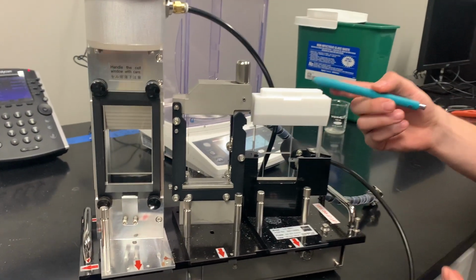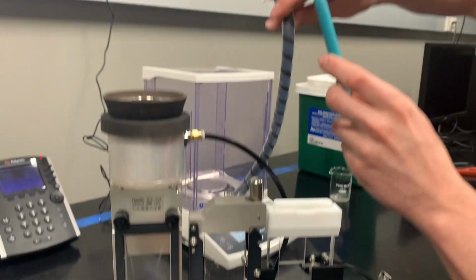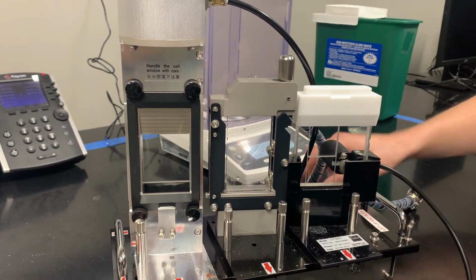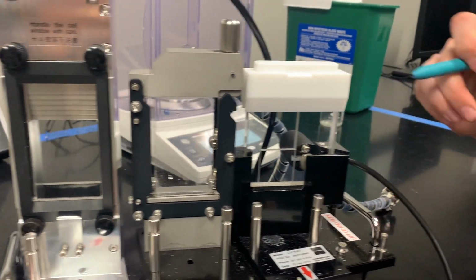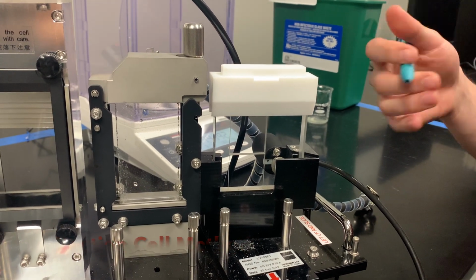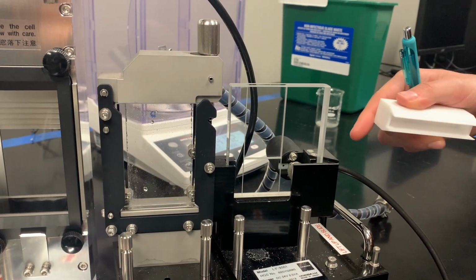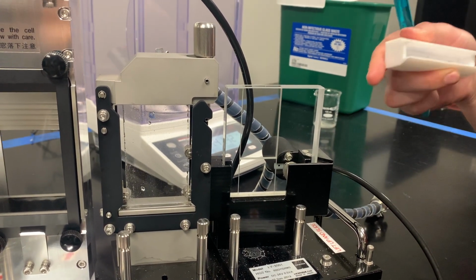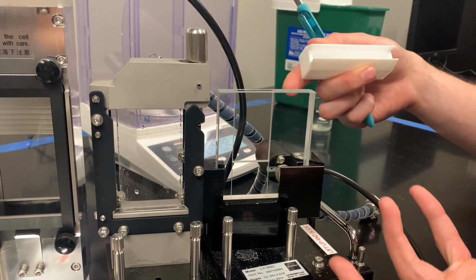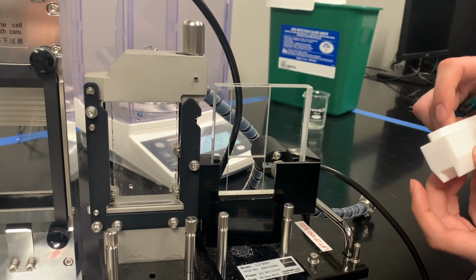Now the second method is the liquid cell method, in which case the sample is dispersed in water, at which point it comes down this hose into the window, once again into the path of the laser for a measurement to be collected. Now the third method is the fraction cell method, for the case where the user doesn't want the solvent to be water. You can fill this fraction cell with a solvent of choice, whether that's isopropanol or acetonitrile, really whatever the particles are compatible with. Again, this window is placed in the path of the laser, allowing a measurement to be collected.